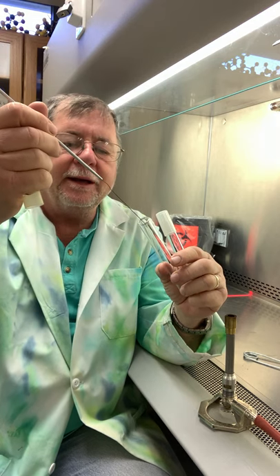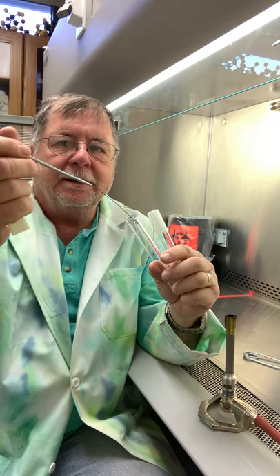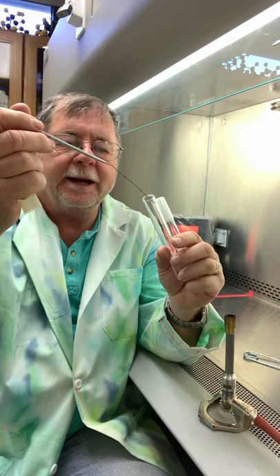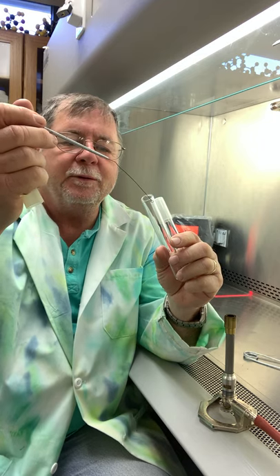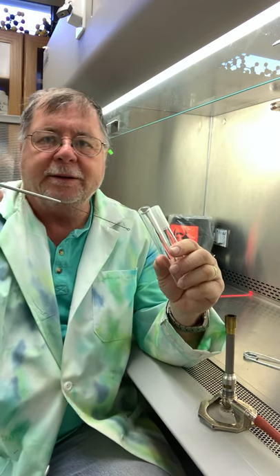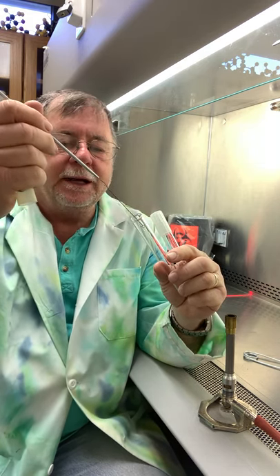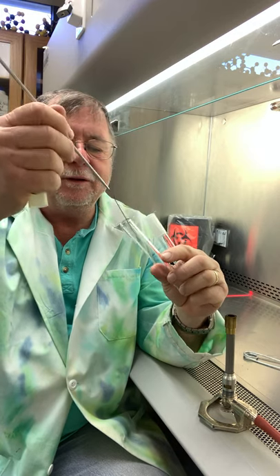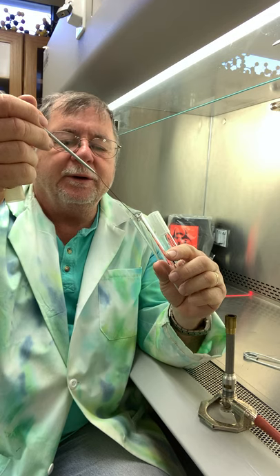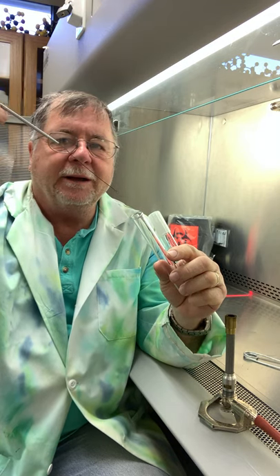And you come out, and then it's important at the exit that you do not have this contacting the inside of the tube, because when you bring it out, watch what happens. It flicks, and then you just splattered bacteria all over. So we want to come up, and you can touch the walls anywhere on the way up, but just before you exit, you want to make sure you're in the center, and then you come out cleanly.